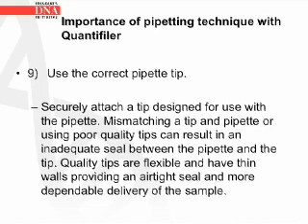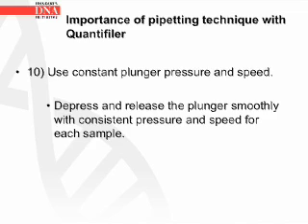Number 9. Use the correct pipette tip. Securely attach a tip designed for use with the pipette. Mismatching a tip and pipette or using poor quality tips can result in an inadequate seal between the pipette and the tip. Quality tips are flexible and have thin walls, providing an airtight seal and more dependable delivery of the sample. And for the final tip for better pipetting technique, number 10, use constant plunger pressure and speed.